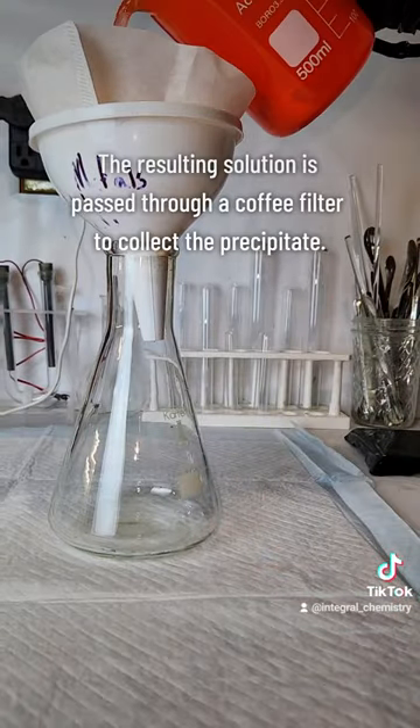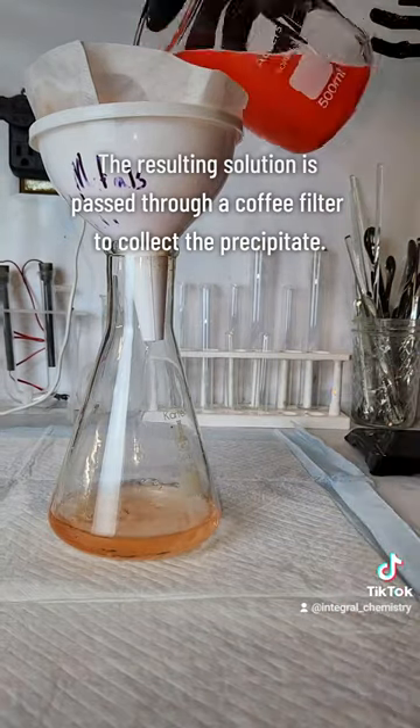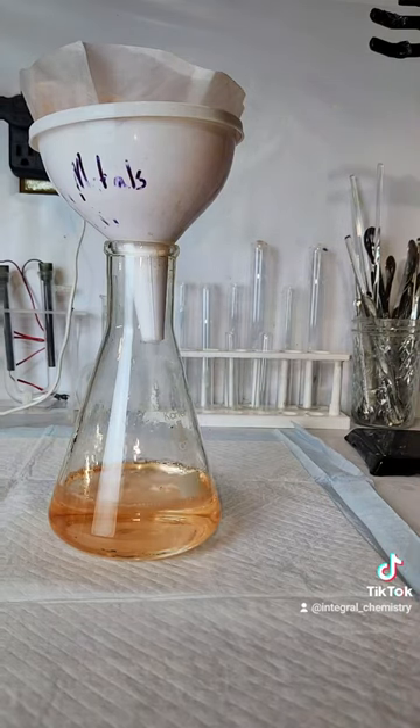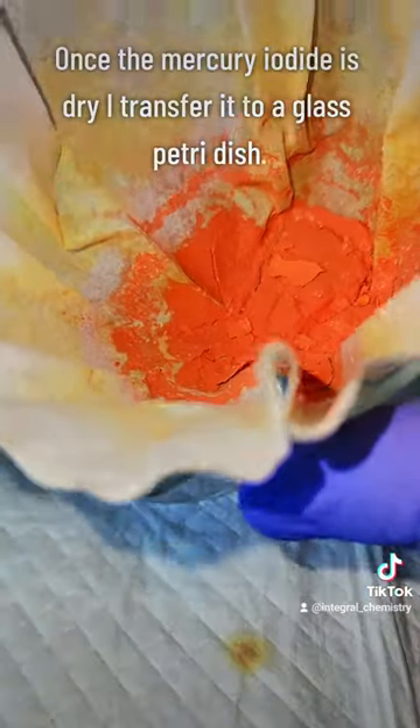Anyway, my next step is to pass the solution through a coffee filter to collect my precipitated mercury iodide. This is allowed to dry for a day or two, and at that point you need to be very careful of this compound as it can easily form dusts which are extremely dangerous if inhaled.